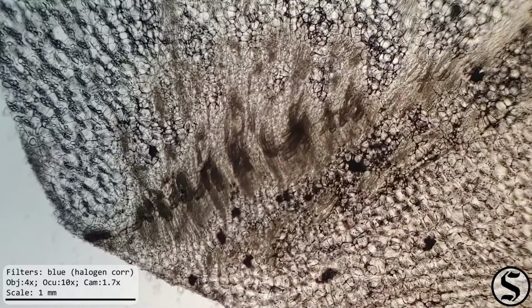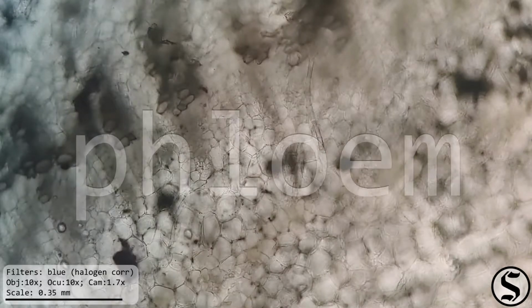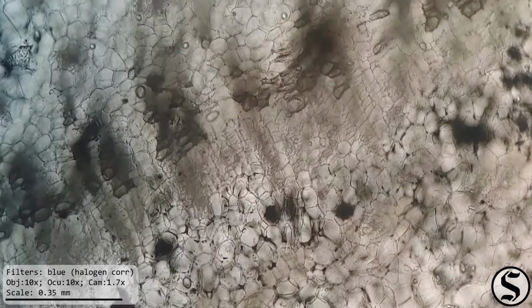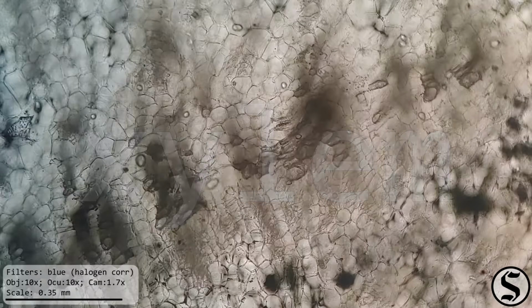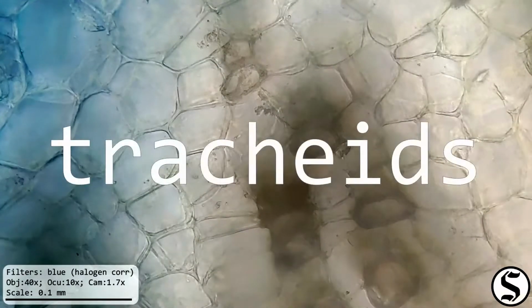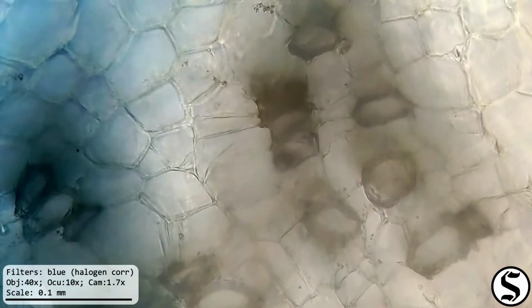As we continue up the plant, we can see a vascular ray, and on either side of that is phloem. That's from the Greek word for tree bark, and that carries sugar around. And then in the middle, we have the xylem. That's the Greek word for wood, and that part is responsible for transporting water around, and that's why it has these tracheids. Those are these tubes you can see, and that comes from the Greek trachea, meaning windpipe.